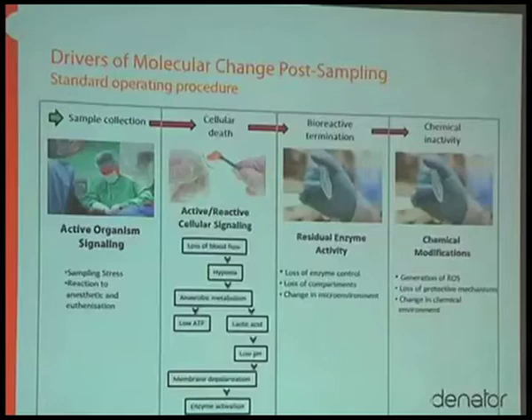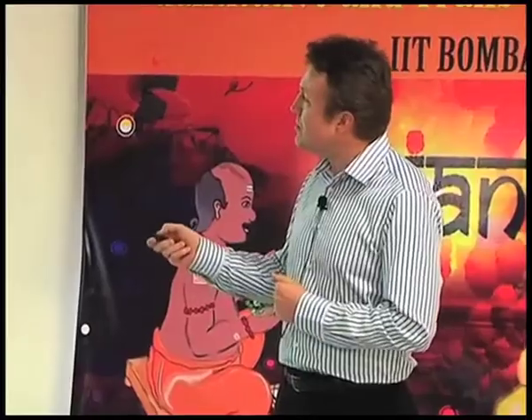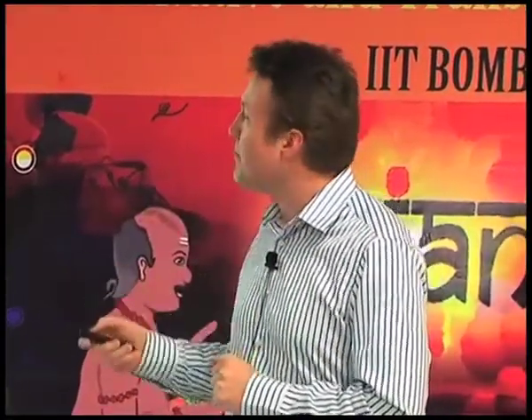But in the very first phases it will start primarily with phosphorylations, and lipids will also start to degrade. So from the moment the sample is taken, or really, if it's an animal, the moment the animal dies, that's when the blood flow stops. That's when the clock starts ticking and these changes start to occur.